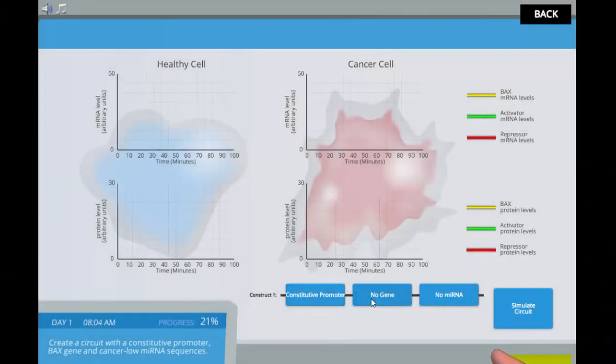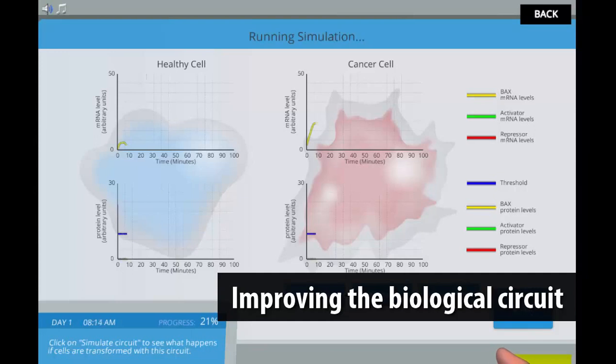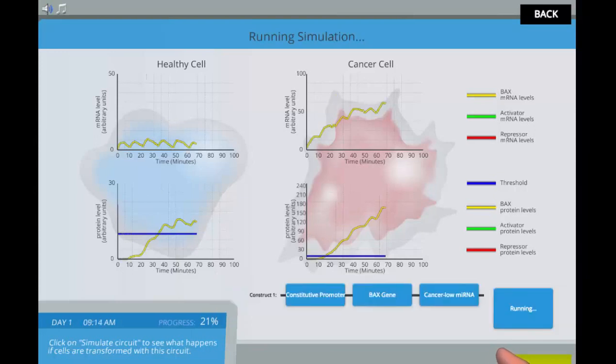In this lab, students combine different biological parts to create biological circuits and test them in a cell simulator.